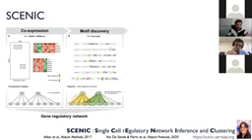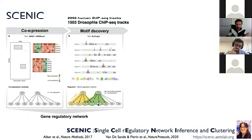And then in the second step of SCENIC, we use all these gene modules and do motif discovery in regions. In the fly, we use 10 kilobases around the transcription start site. In human, we use 20. So it's still relatively close to the TSS, but in quite some domain around the TSS of all these genes, we look for motifs. And if we find the motif of that regulator to be enriched in this gene set, then we keep this and we prune it further to keep only the direct target genes with the motif. And then we arrive at what we call a regulon. And then we score again all the single cells with these gene sets, which are regulons of a TF and their predicted target genes. This method now also works with ChIP-seq tracks from ENCODE, for example, where we search not only for enriched motifs, but also enriched ChIP-seq peaks for transcription factors.